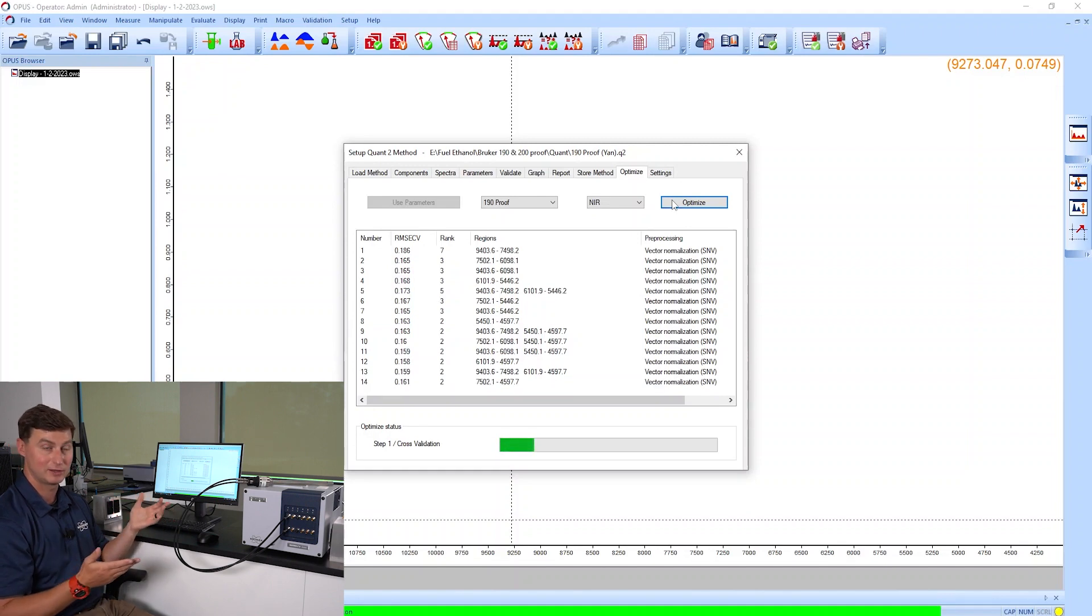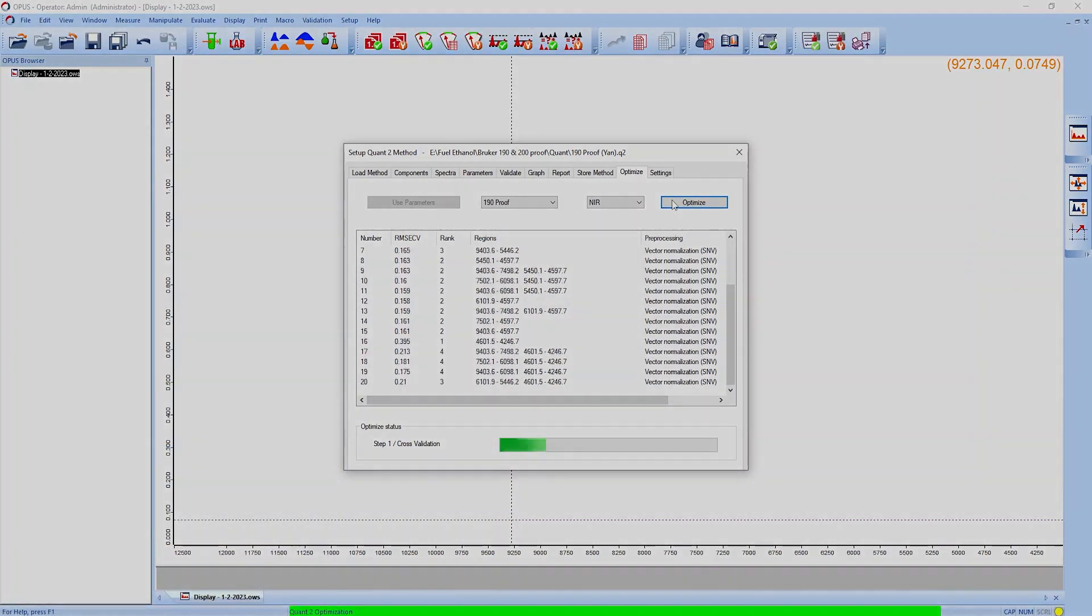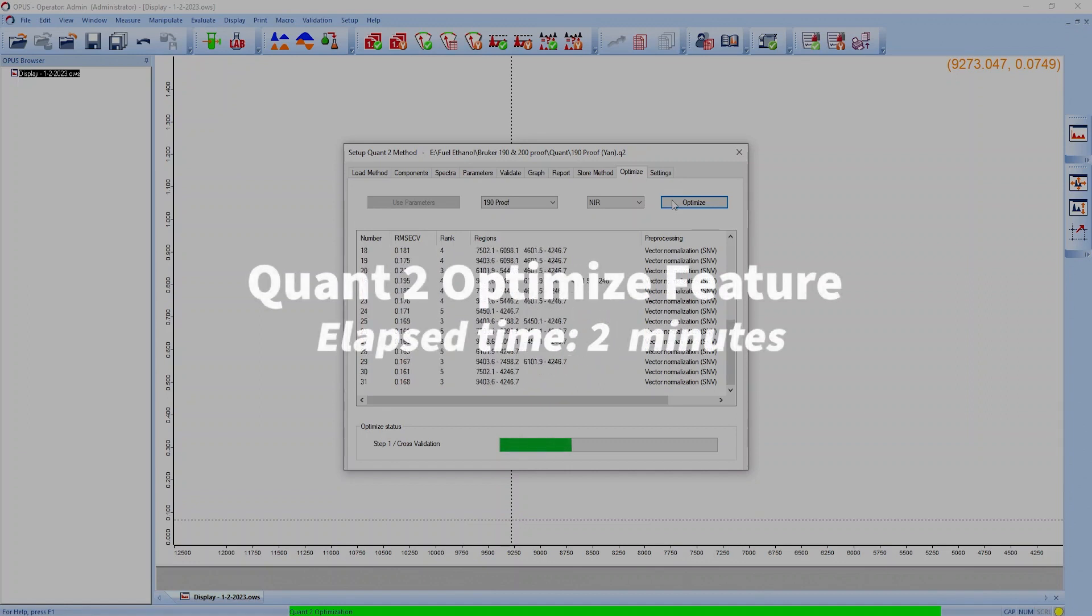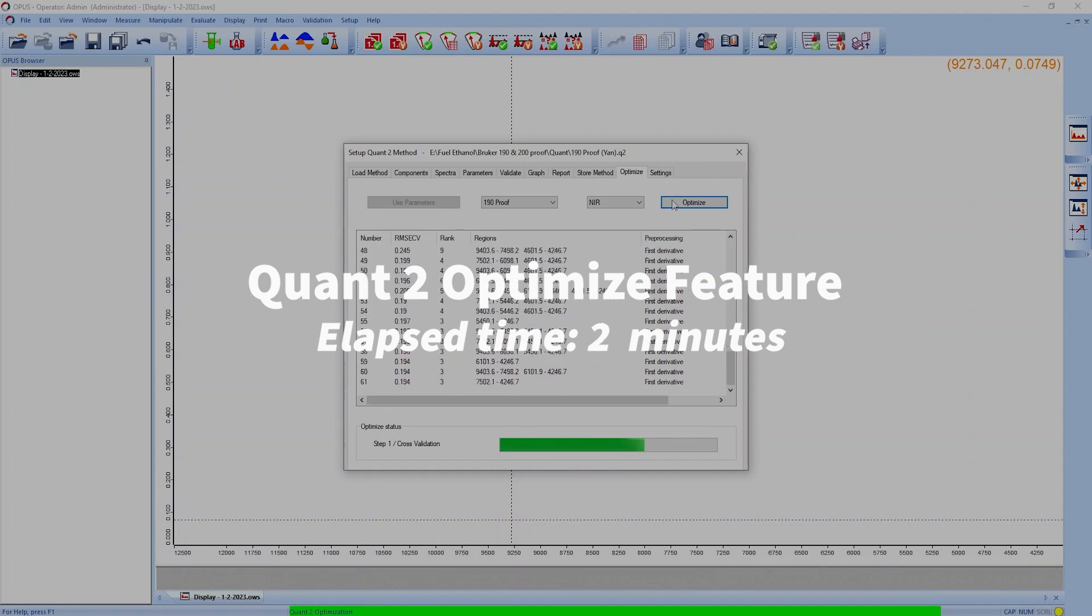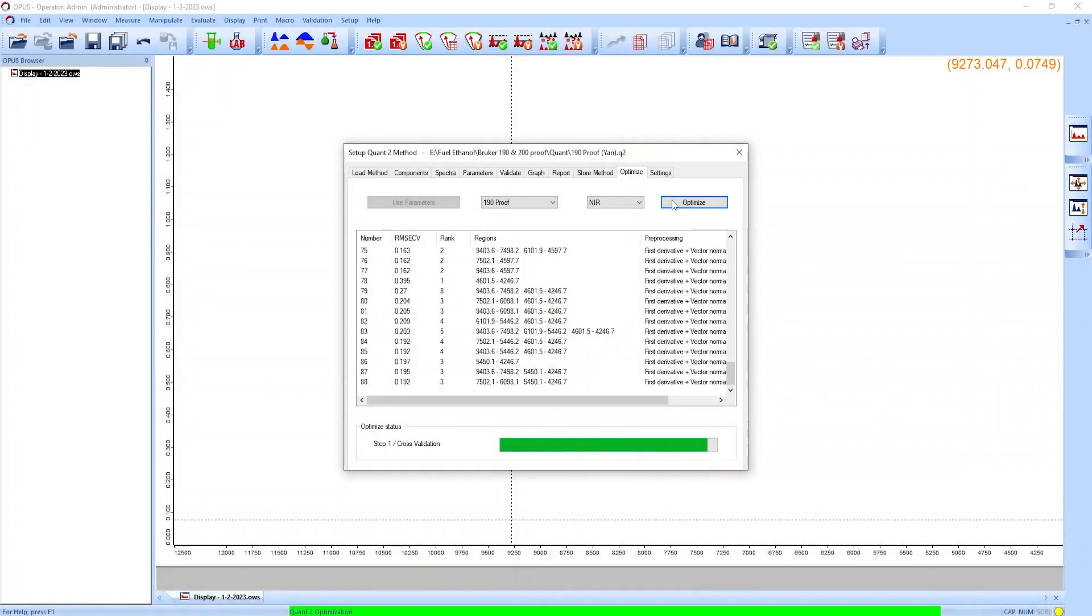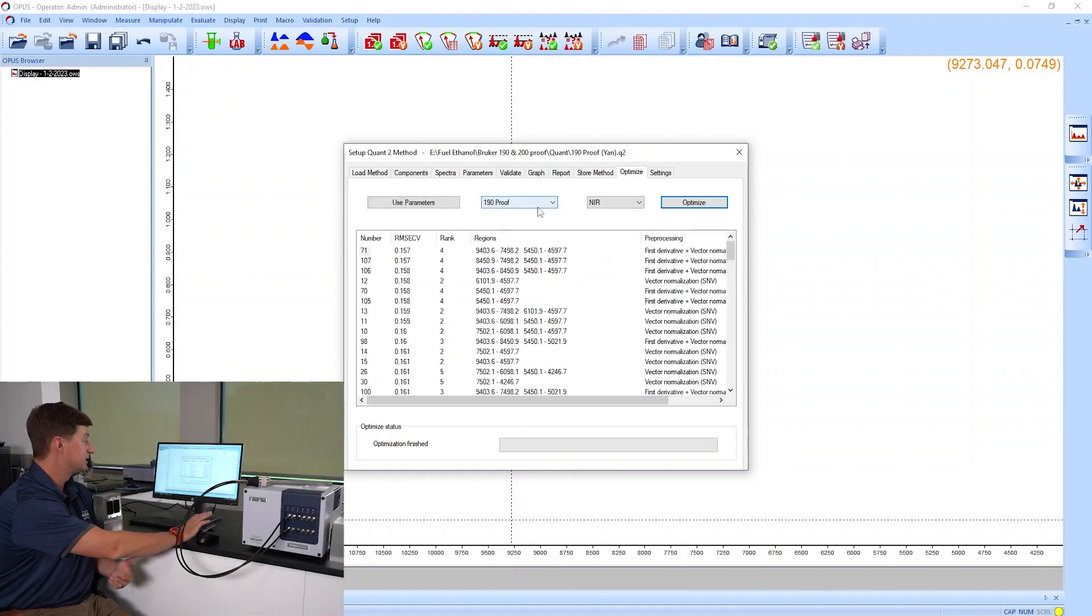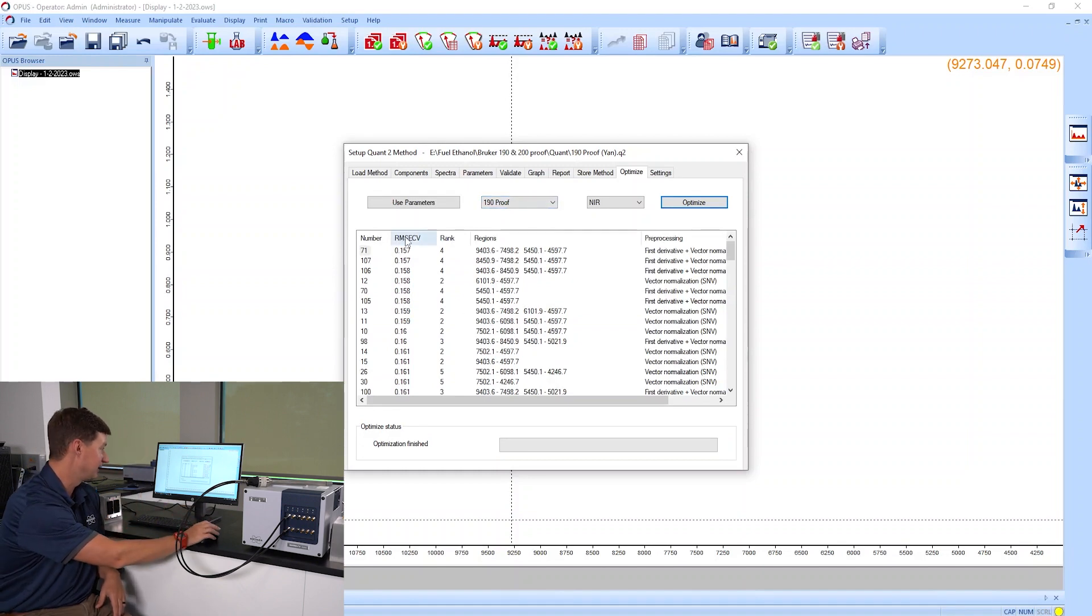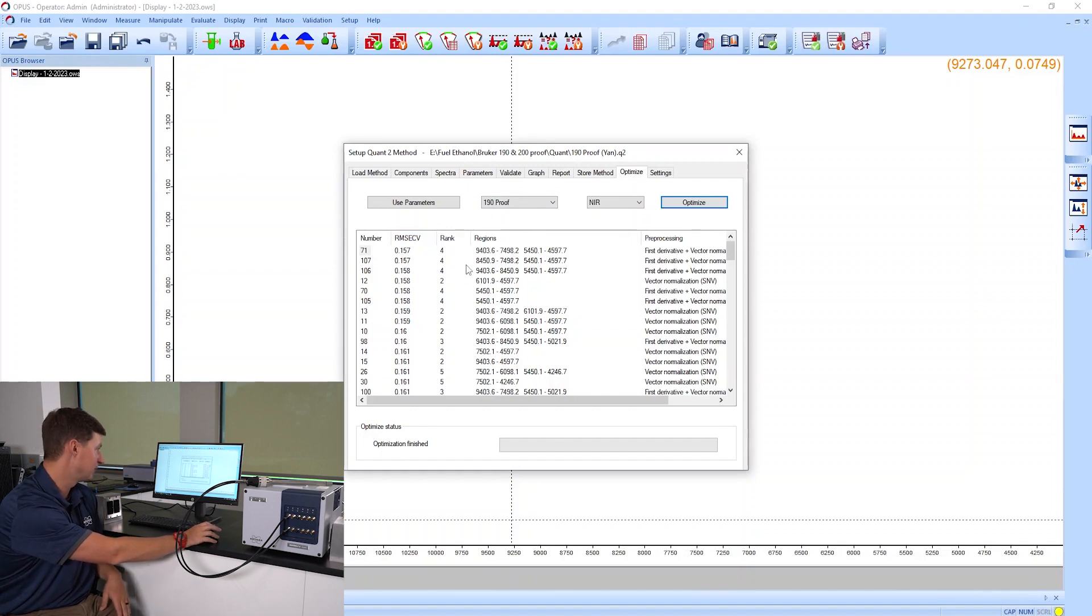Now it's done with the optimization. It sorts things by the rank or by the error and the rank, so the rank being the number of factors. Then it tells us what regions it's using and what type of pre-processing.